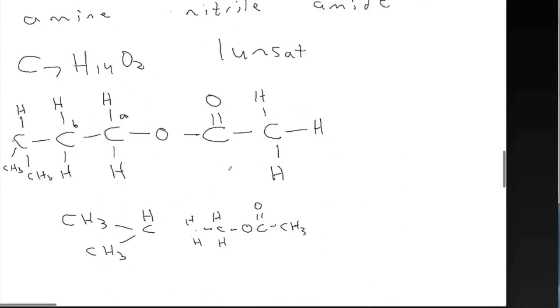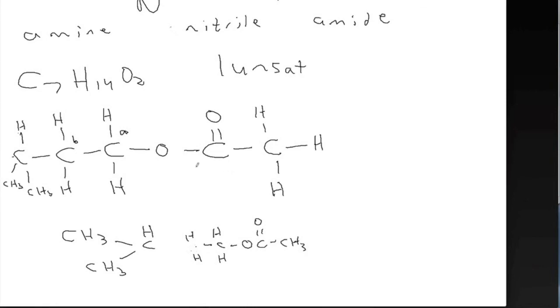Okay. So my main advice to you that would have helped you here would be to start with the ester and try working away from the ester, assigning the peaks as we go away, if that makes any sense. Does that seem like a method you could have used? All right. Why don't we do one more problem? Let's do compound 7 and then call it a day, if that's okay with you.